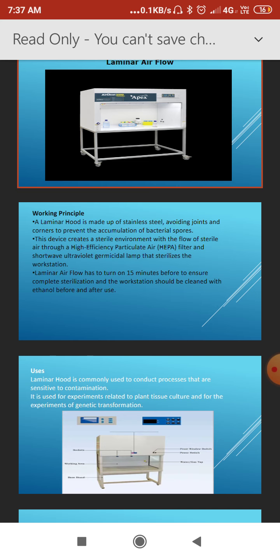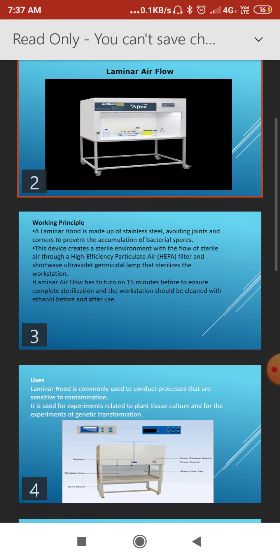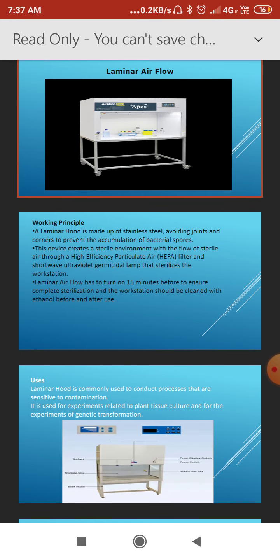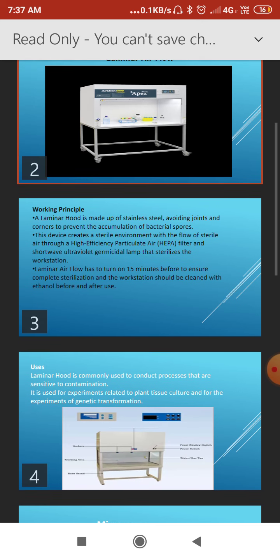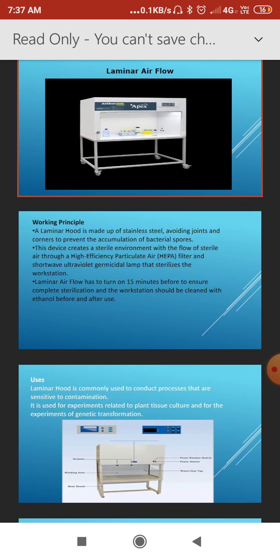The laminar airflow has to be turned on 15 minutes before use to ensure complete sterilization, and the workstation should be cleaned with ethanol before and after use. In this laminar airflow there is a provision of ultraviolet light and a HEPA filter.